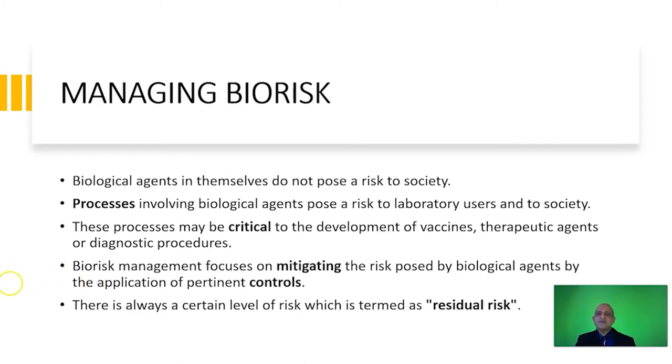But what we have to understand is that research processes are critical for the development of therapeutics, and we cannot restrict research into these particular pathogens. So biorisk management focuses on mitigating the risk posed by biological agents by the application of pertinent controls. I will describe all these terminologies in subsequent lectures. I have highlighted the keywords, which are mitigating and controls. And there is always a certain level of risk which is termed the residual risk.